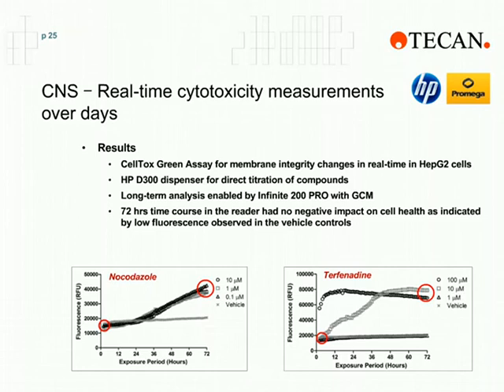So this is very vital information in drug development when you want to find out how fast a drug is actually acting inside a cell or on a cell per se. And this is only achieved by using kinetic assays. And kinetic assays, in that sense, with 72 hours of results, are an excellent way to find out how a drug is actually working inside a cell.